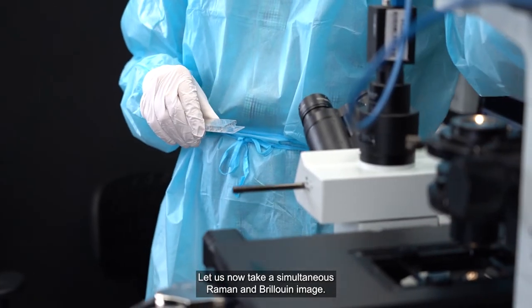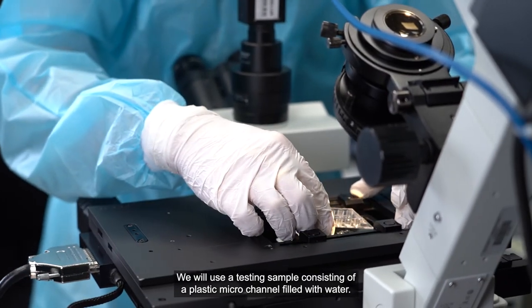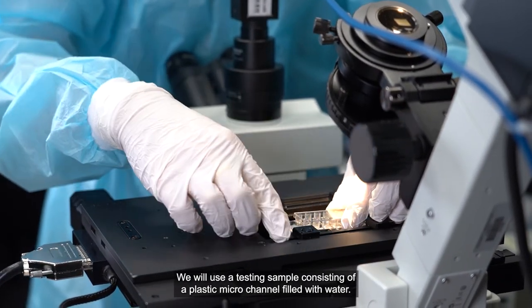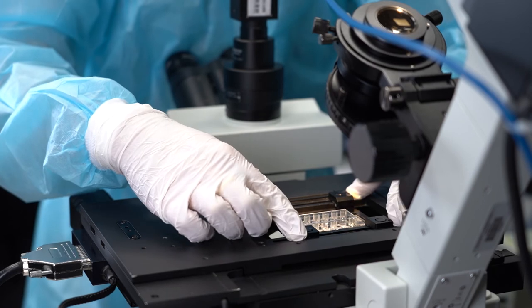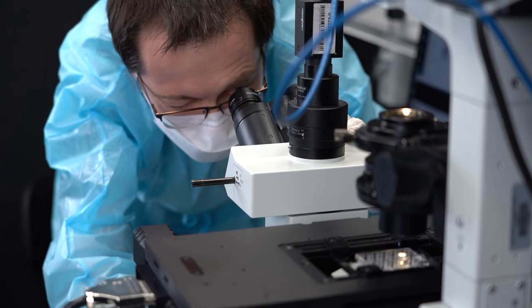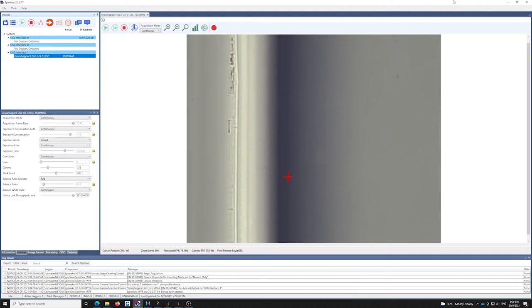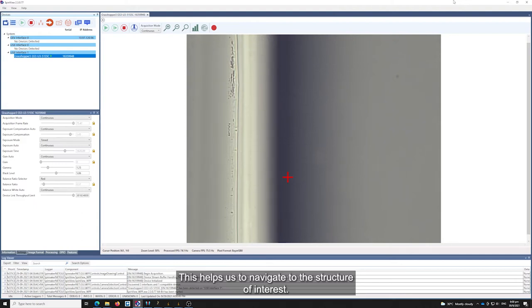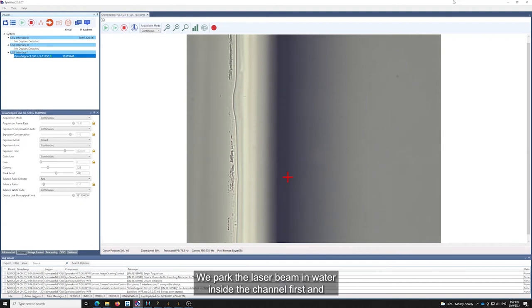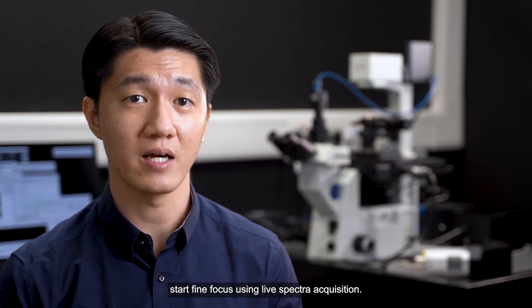Let us now take a simultaneous Raman and Brillouin image. We will use a testing sample consisting of a plastic microchannel filled with water. We place the sample on the stage and use brightfield image to focus. The laser beam position is marked by this crosshair in the brightfield image. This helps us navigate to the structure of interest. We pump the laser beam in the water inside the channel first, and start fine focusing using live spectral acquisition.